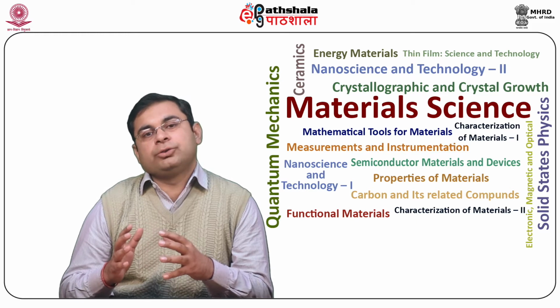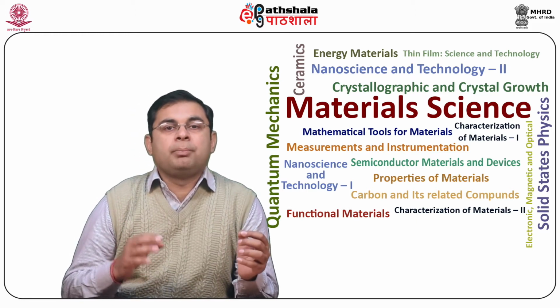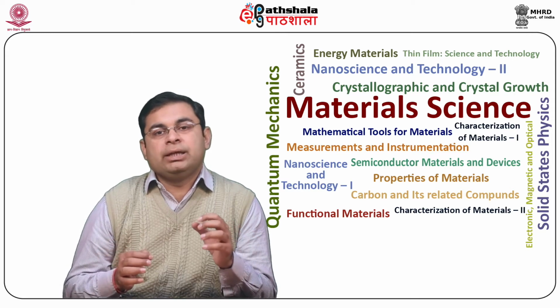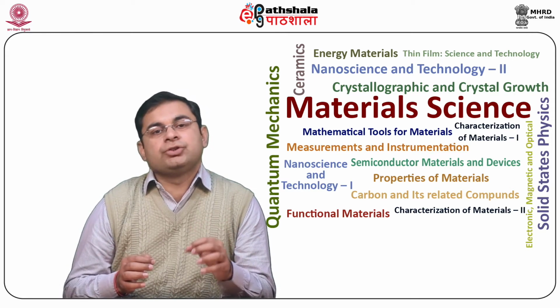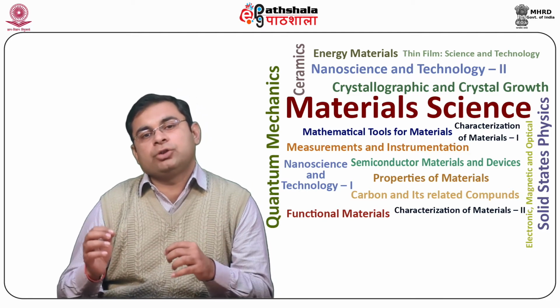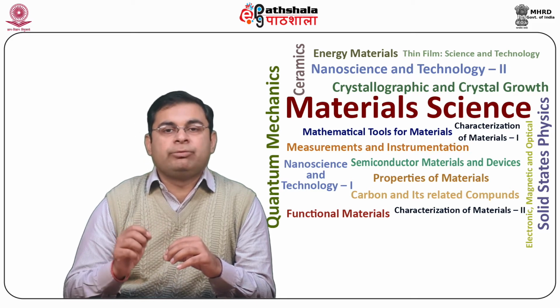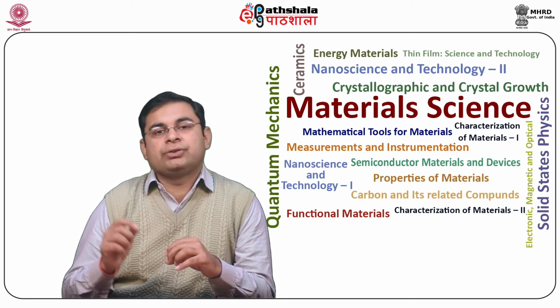However, Auger spectroscopy is less accurate than XPS for obtaining bond information. AES has depth resolution of 5 to 25 angstrom, which makes it particularly attractive for depth profiling and simultaneous ion sputtering.